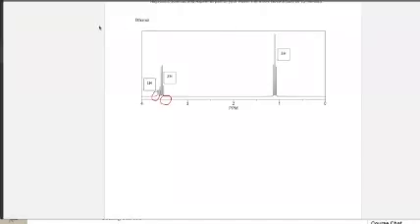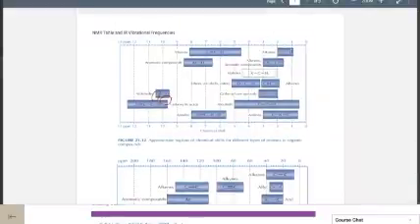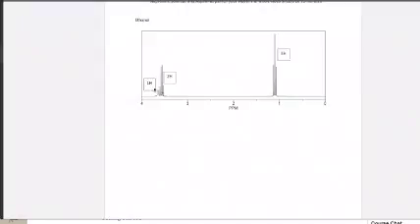So if we take a look at the spectrum, we can see that alcohol, clear on my drawings. So alcohol is usually around 2 to 5. In our case, we are around 3.7. So this can represent the one alcohol because, as I mentioned before, the OH only has an integration of 1, which will make sense here.